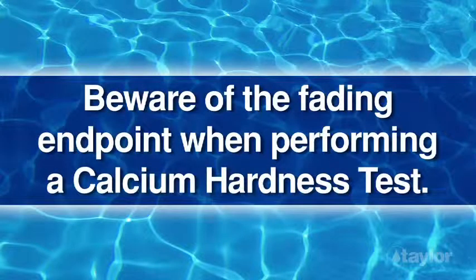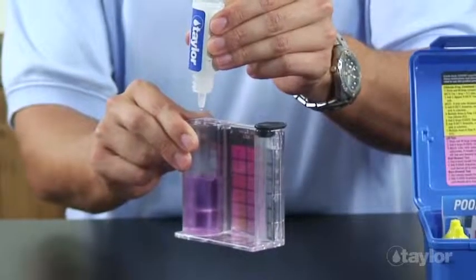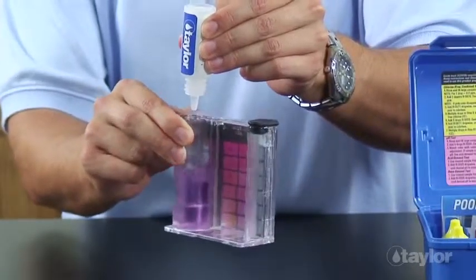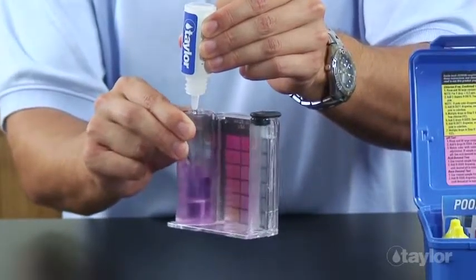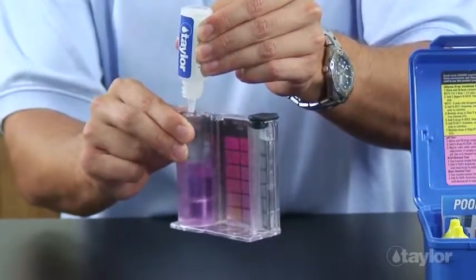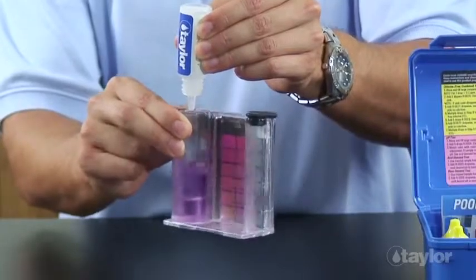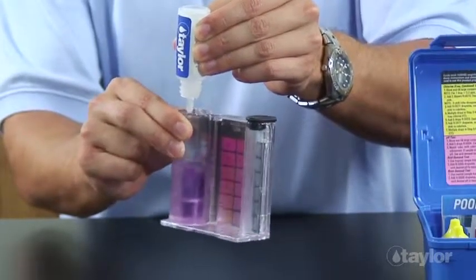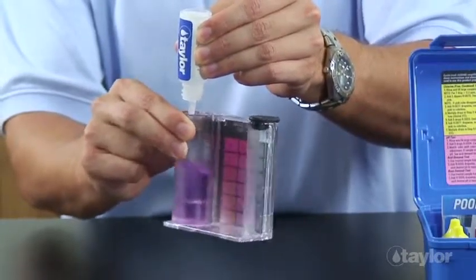Beware of the fading endpoint when performing a calcium hardness test. A fading point is the most common error in a calcium hardness test. Instead of obtaining a well-defined permanent endpoint, some color change is observed, but soon the sample reverses to the original color.